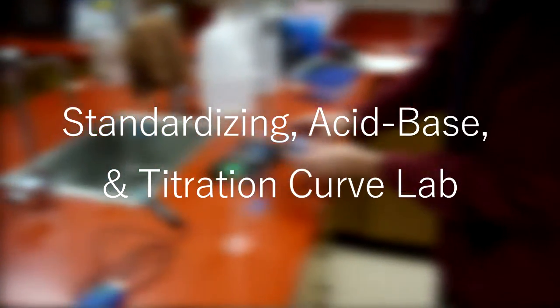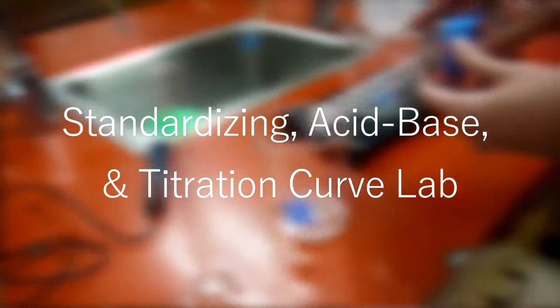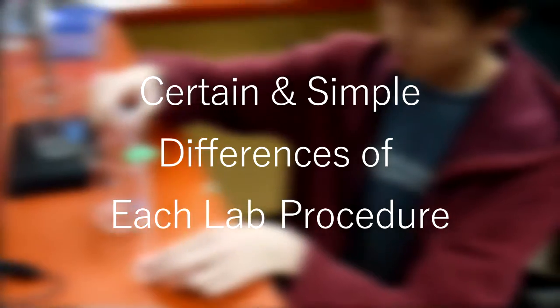Hello and welcome to the Standardizing Acid Base and Titration Curve Lab. The purpose of this video is to help you and your lab group prepare yourselves for these three separate but similar labs. In this video, you will learn to prepare, set up, and analyze data for each lab. You will also learn the certain and simple differences to each lab procedure. It's important to know these differences to prevent confusion.